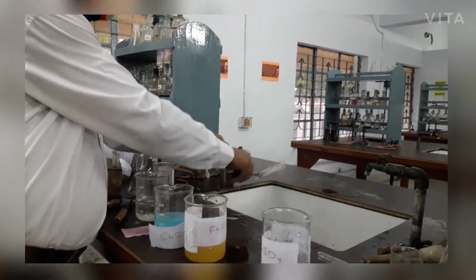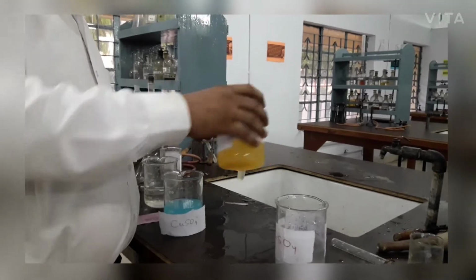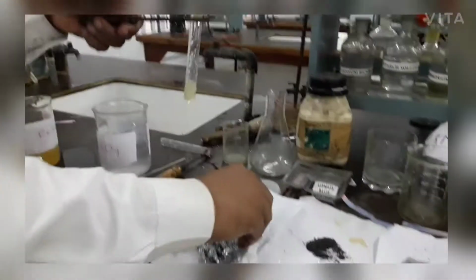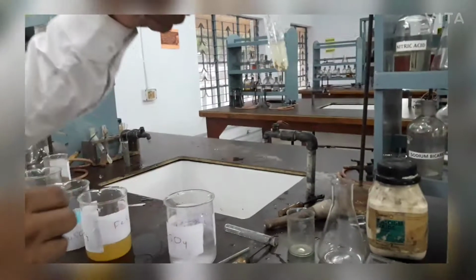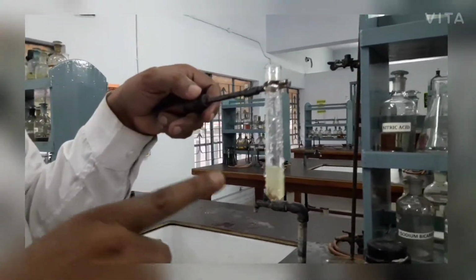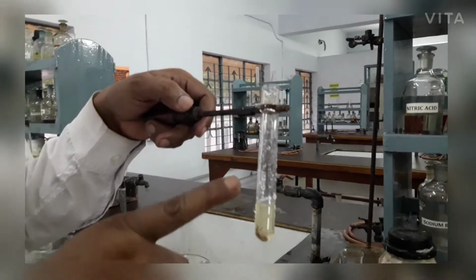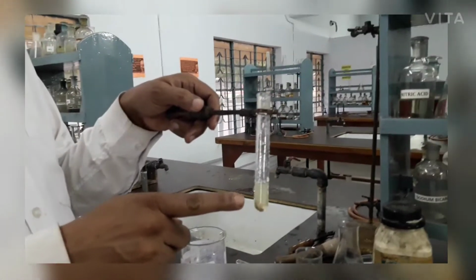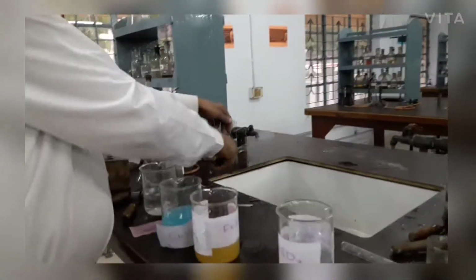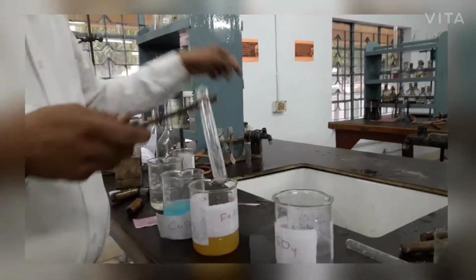Now again we are taking iron sulfate and we are adding copper in it, and we see no reaction, means copper cannot displace iron because iron is more reactive than copper, so reaction doesn't take place here. So copper is less reactive than iron.